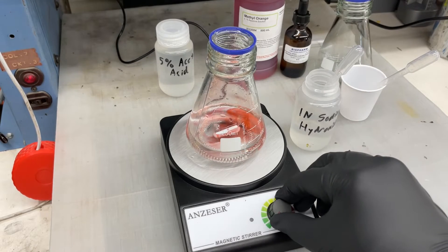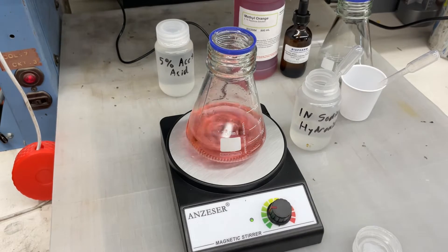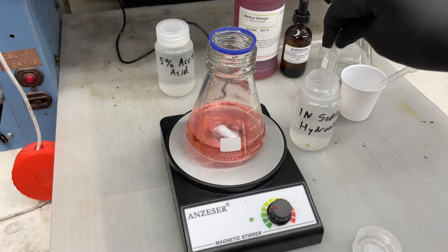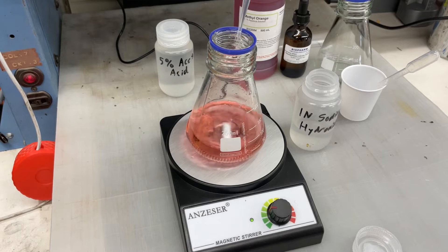Now I'm going to turn on the magnetic stirrer and start our titration with one normality sodium hydroxide solution. We're measuring how many milliliters it takes of the sodium hydroxide solution to change this to orange. Then we take that number and multiply it by 9.8, and that tells us how much free sulfuric acid is in our tank. I do low current anodizing, and that takes 100 grams per liter. Normal anodizing is around 163.